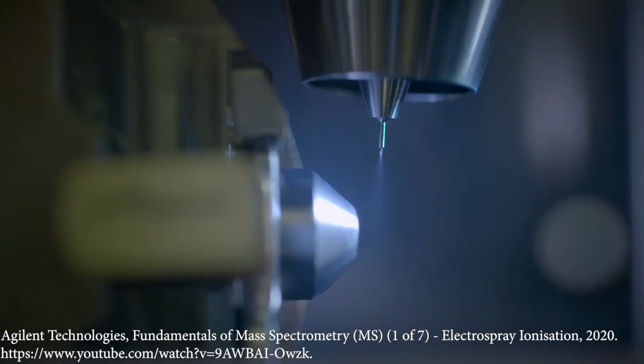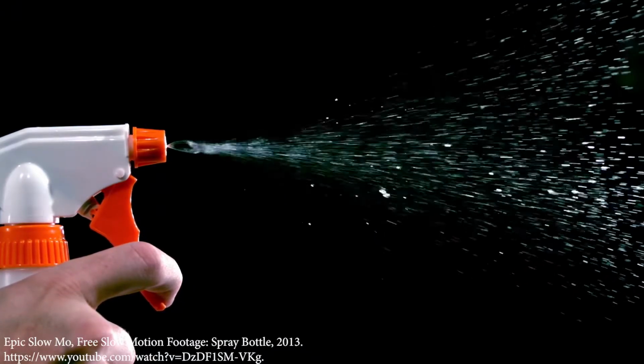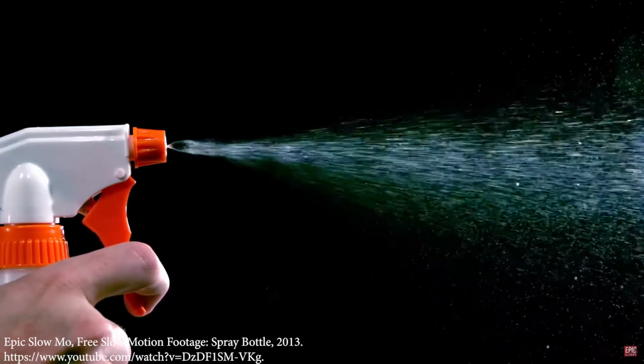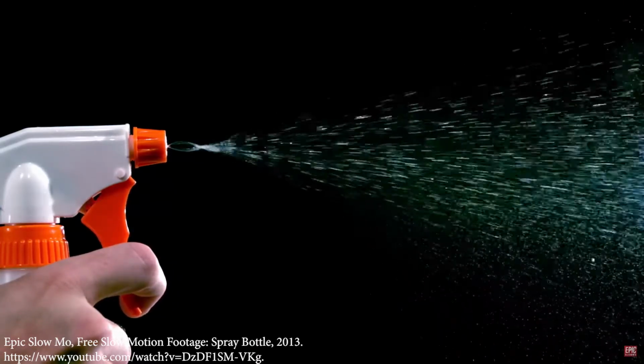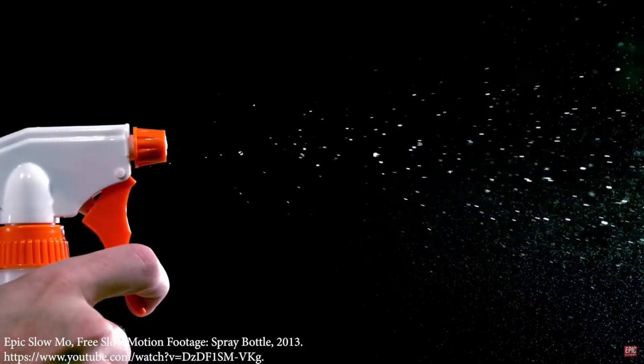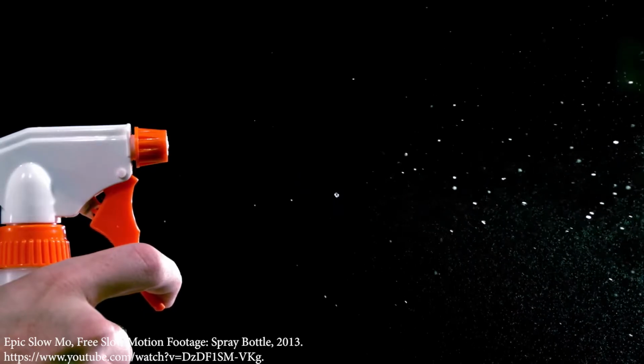Here's yet another electrospray source, but this one is in action. You can faintly see that spray coming out. So let's talk about what spray is. If we look at this cool slow motion of a spray bottle, there's no voltage or anything being applied here, but it's generating what are called aerosols. These are not gases. These are tiny particles of liquid, but they're so small that they float in the air, and they dry up really, really fast.